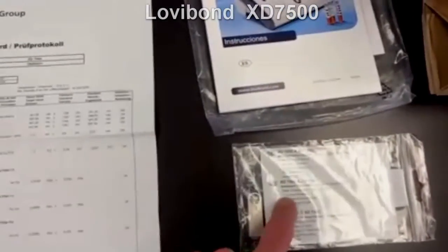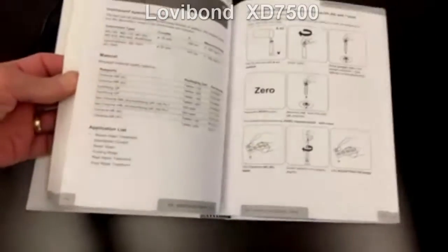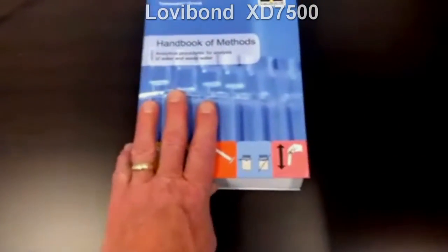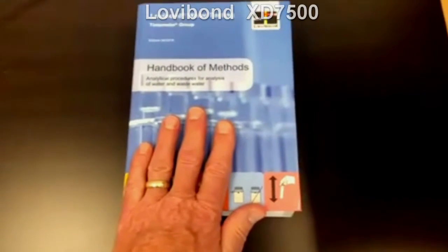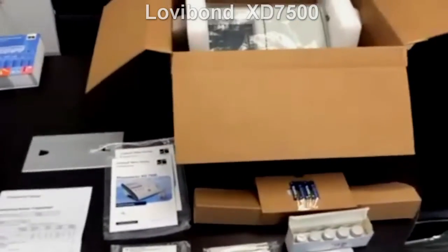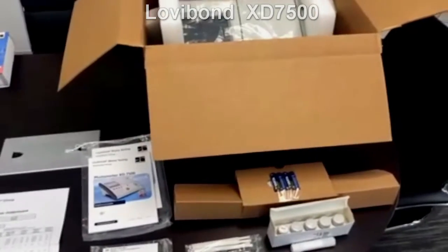One quick comment on the handbook of methods: for those who have never seen it, this is one of the earlier editions. For those familiar with the Hach Water Analysis Handbook, it's similar to that. It's a great reference guide. This comes electronically with the instrument. If you want to buy a printed version, it's probably in the price list; if not, you can contact Sandro and we can get pricing for you. So that's everything that comes in the box, and now we'll take a tour of the instrument itself.